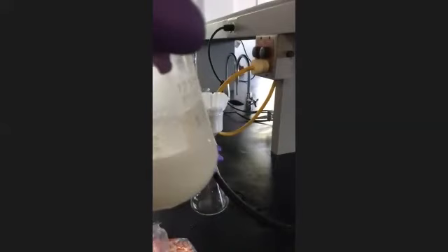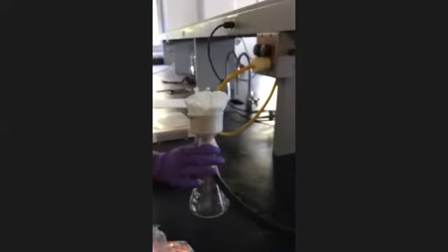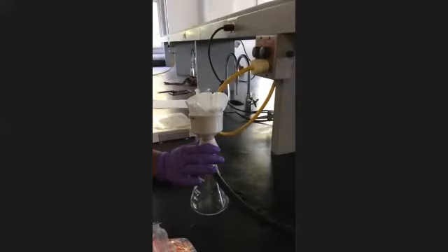And since we have that, let me see if there's a glass rod in this drawer. Yeah. Sometimes if the aspirin is real chunky, you can break it up. That's a physical change, not a chemical change, so it doesn't matter if you break it or crush it. So I got a glass rod, and I'm just gonna chop that up a little bit, so when I get ready to filter it, it'll all come out.